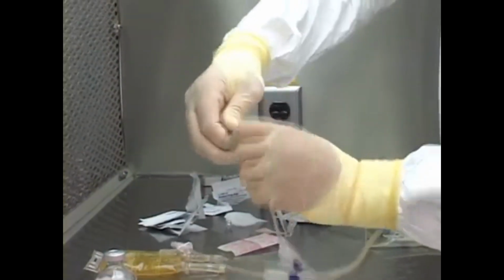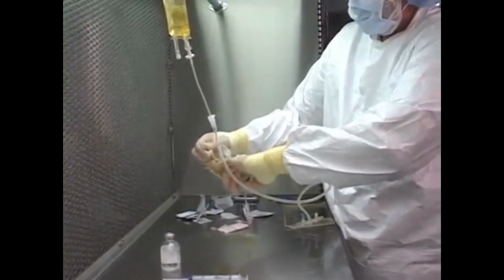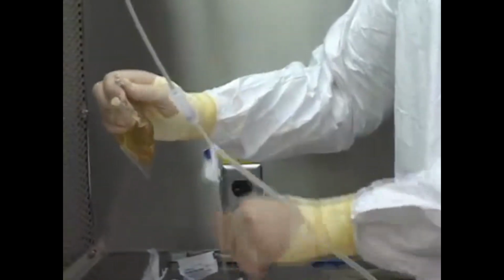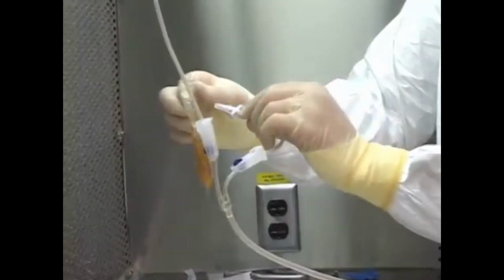Let's have a look at the two gravity fill methods for filling bags, the empty bag method and the underfill method. The empty bag method involves starting with an empty sterile bag that will be used as the final container. Commercially available bags have leads that can be connected to bottles or bags containing the base components. This method can be used for either traditional or 3-in-1 preparations.